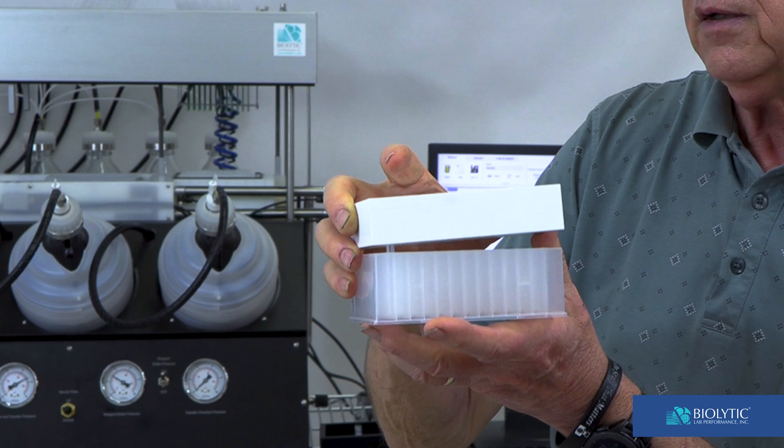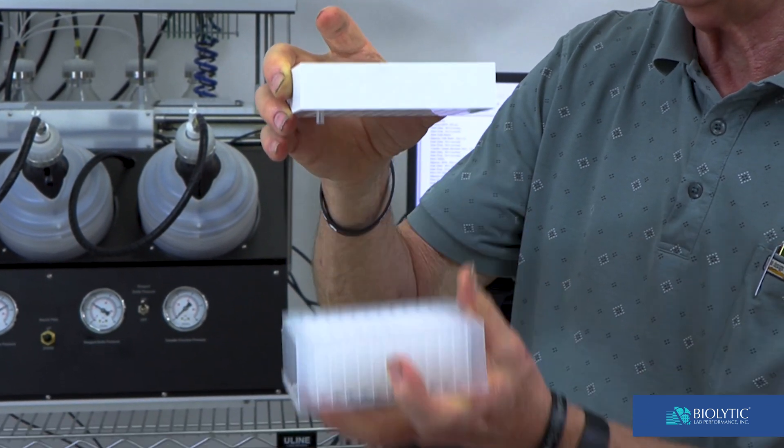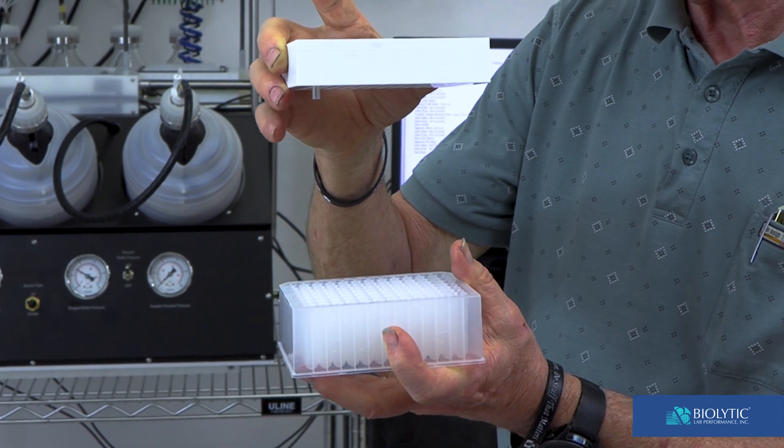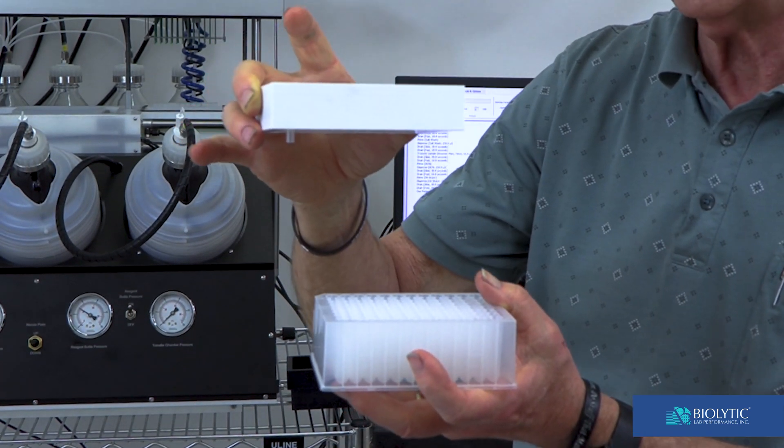When we're finished with a collection, the elevator moves down and then a cover will come in and cover the lower plate inside the instrument.